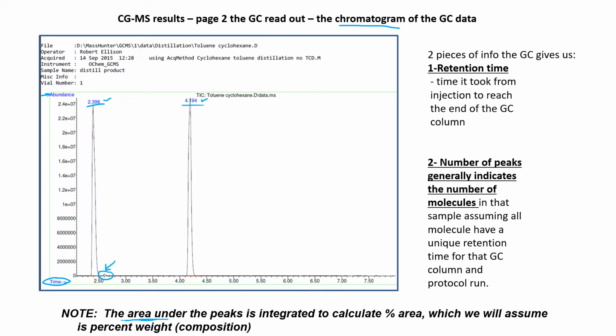That one was probably a real peak of another molecule, but it was below the detection limit that we set for the instrument.